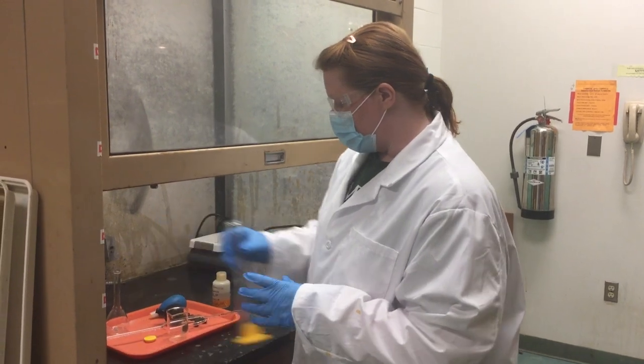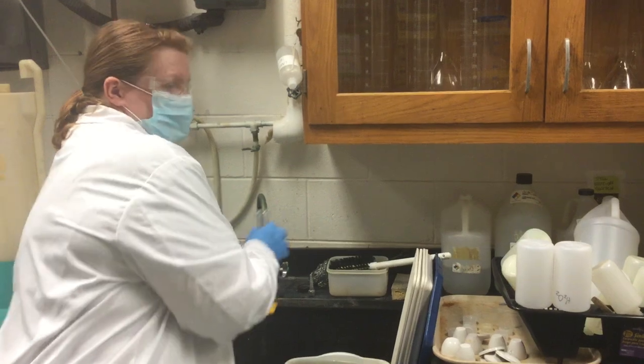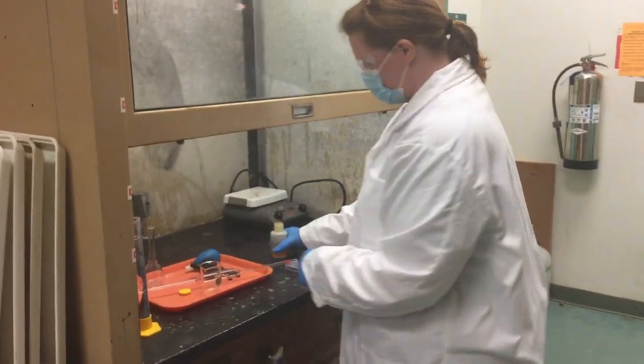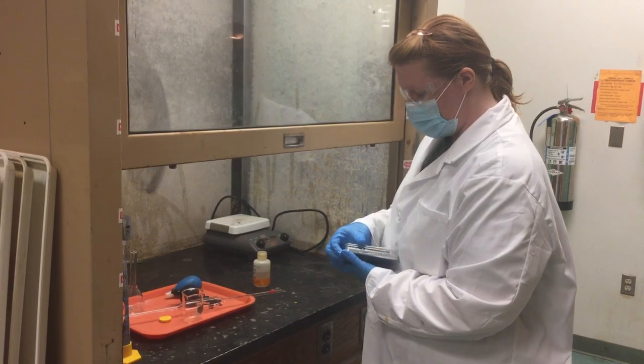The first thing you're going to do is make these dilutions with tap water. You're going to figure out in your pre-lab calculations how much of the concentrated acid or base to add.